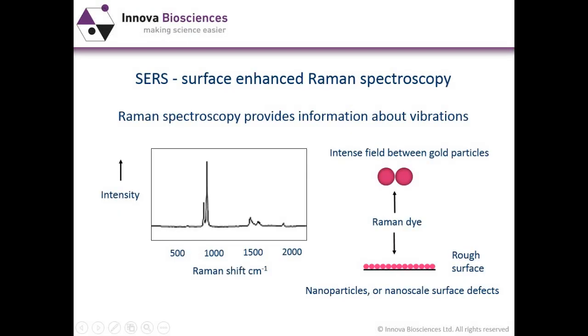Okay, SERS, surface enhanced Raman spectroscopy. This technique has been used by chemists for years. It provides information about molecular vibrations, and that tells you about structure. But it can also be used by biologists to look at interactions between molecules.